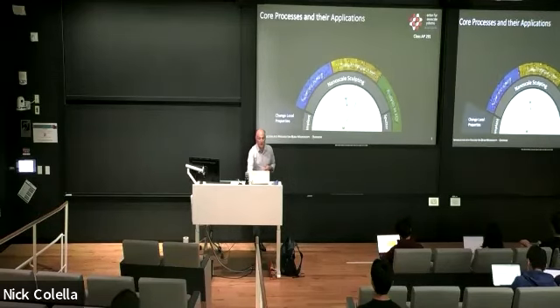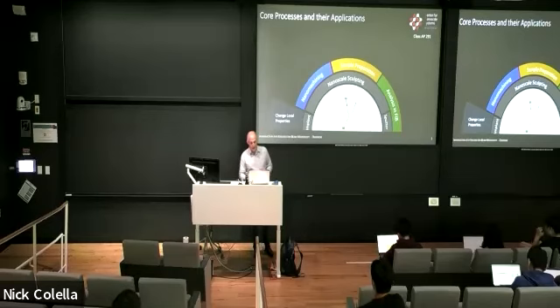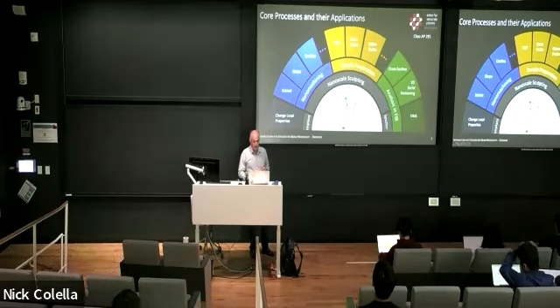With those different properties, we have core applications that are used in our facility. The implantation is not so much used in our case. We are really using it for the cutting, right? So there are three main categories that you can divide the work up. We can simply use the ion beam to machine on the nanoscale.